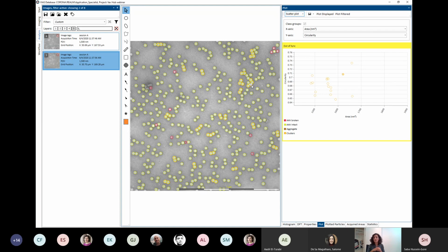So it's VLPs and pleomorphic particles and the analysis that we can do and how we can chop it up. I hope with discussion, you guys can help us to answer the questions. But I guess you guys would have the questions and we would just give you the statistics and the data and see that this is what we are seeing.